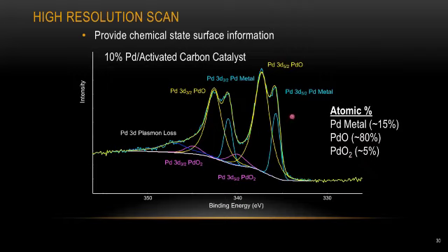For people working on oxide materials, usually you want to do high resolution scanning for the metal peak instead of using the oxygen 1s peak. Usually the oxygen 1s doesn't shift too much with different oxidation states. So to determine the stoichiometry information, the metal peak will be more useful.